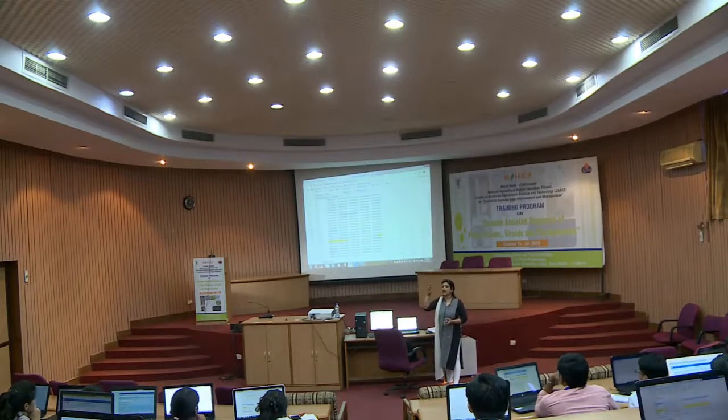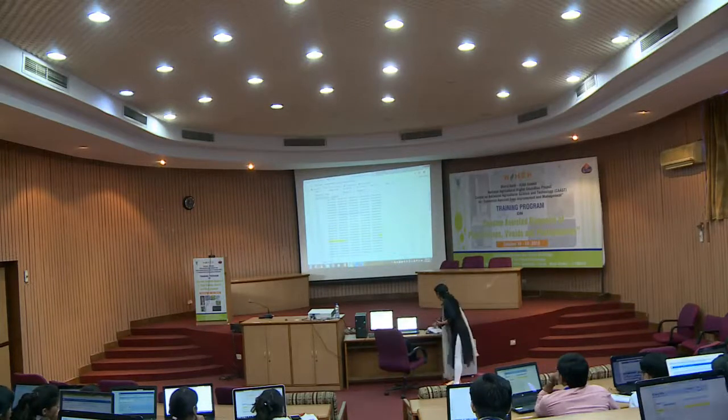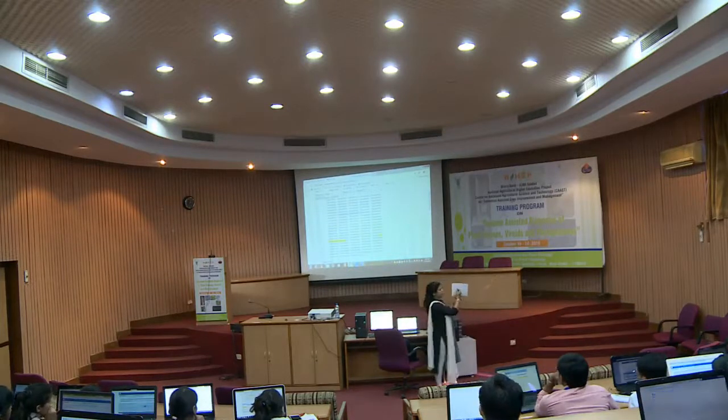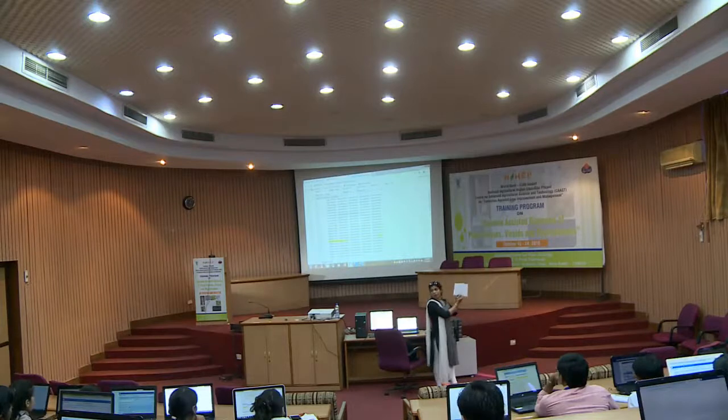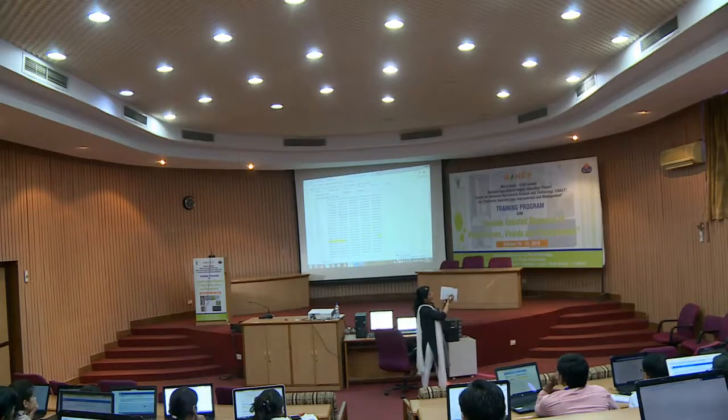There are two things, either you design one internal primer, or, let us suppose you have already designed one primer here and one primer here. So, there you can design two sets of primers, like this is F1, okay. Somewhere here you can design R1, okay, F2, and this is R2.